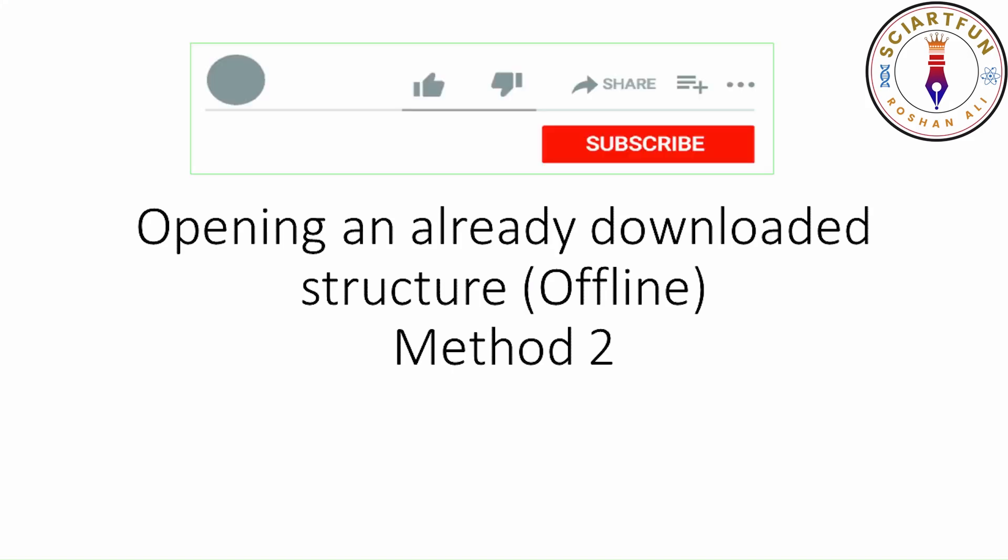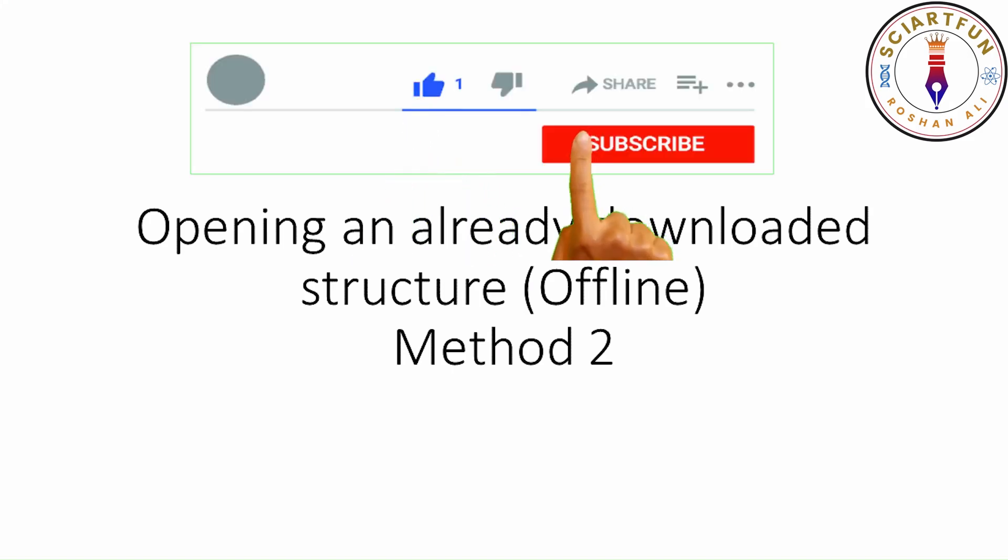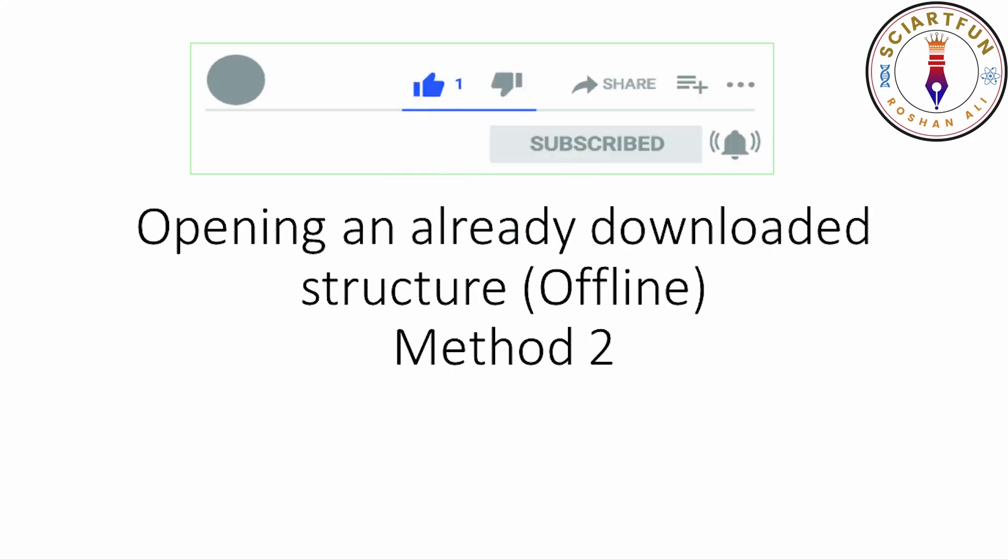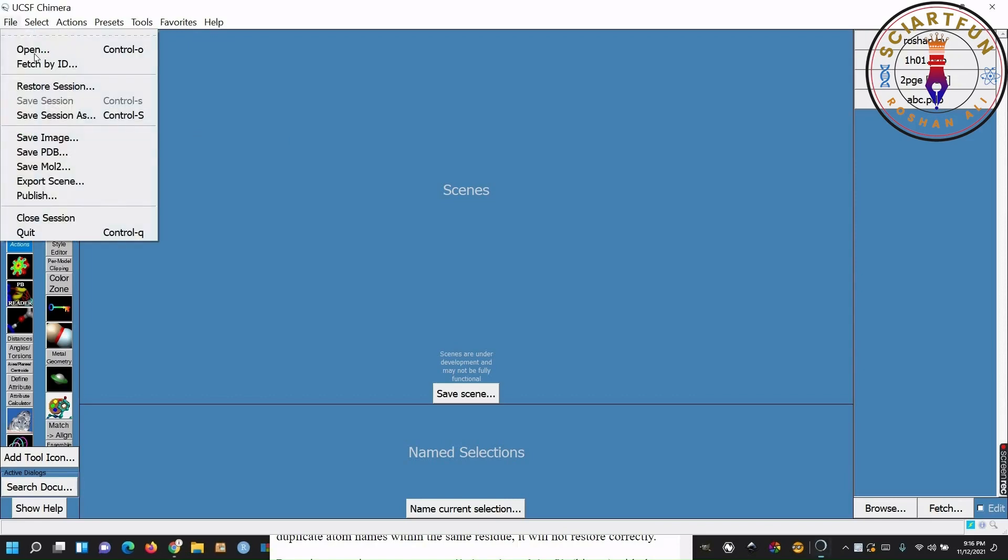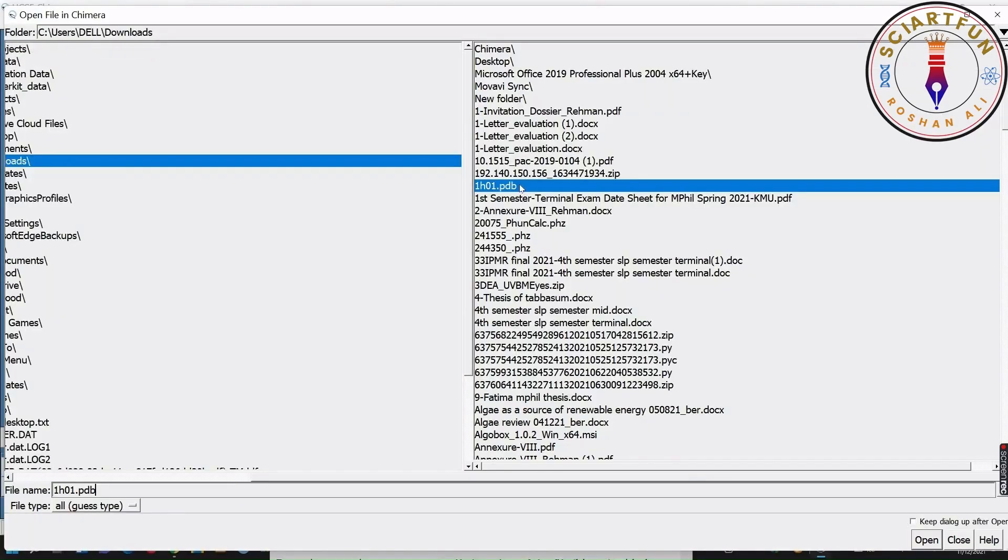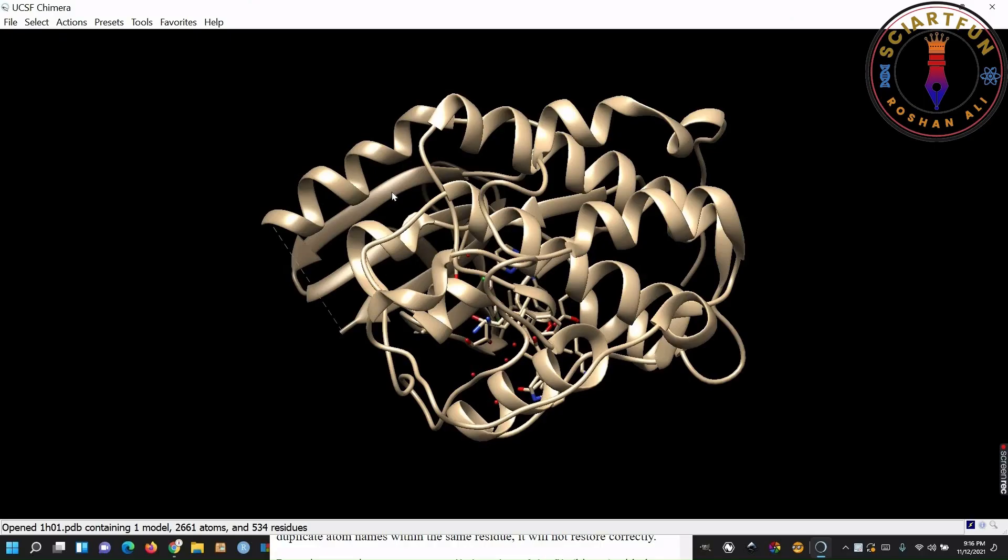Okay, now let's come to the file menu. In the file menu, the first thing I am going to tell you is to open the downloaded structure. This is method number 2. You just need to click open, then go to the location, select your molecule and click open. Your structure will be opened.